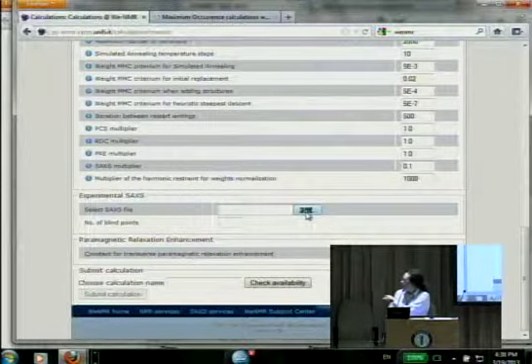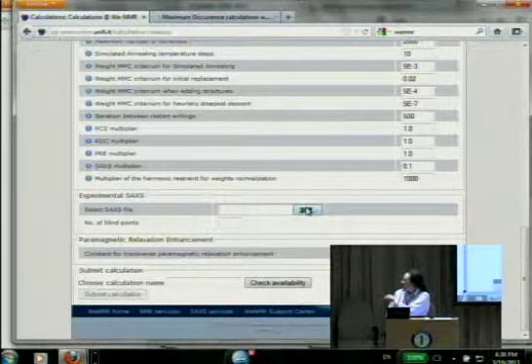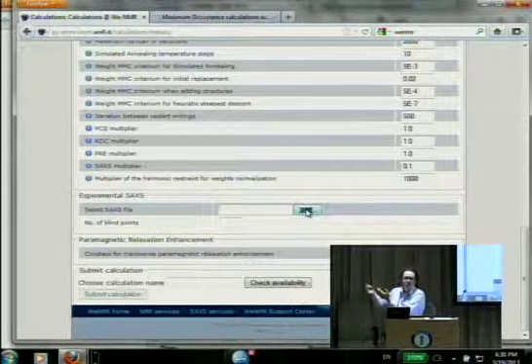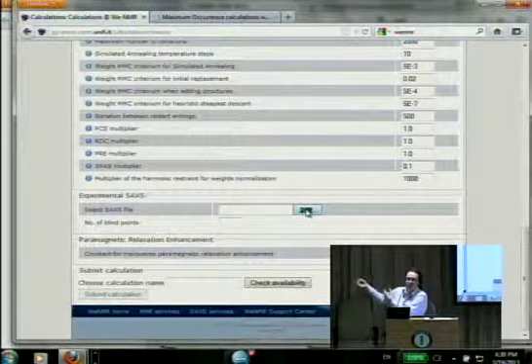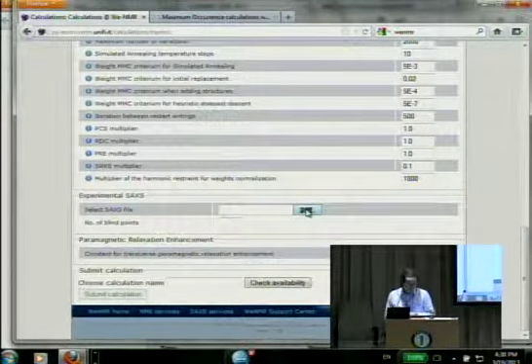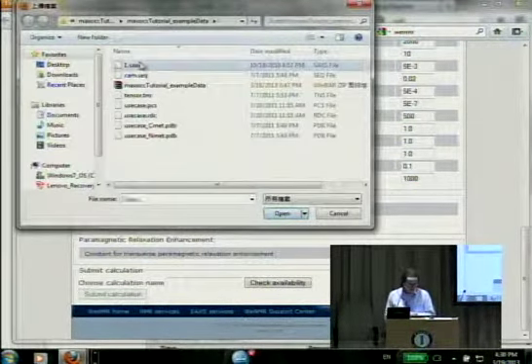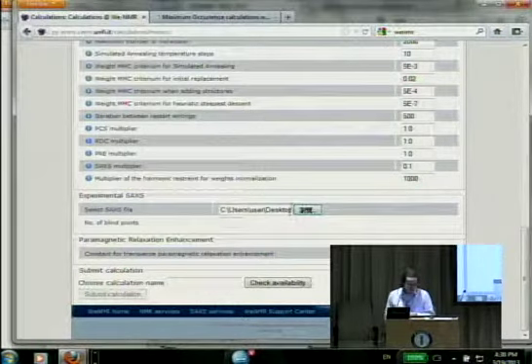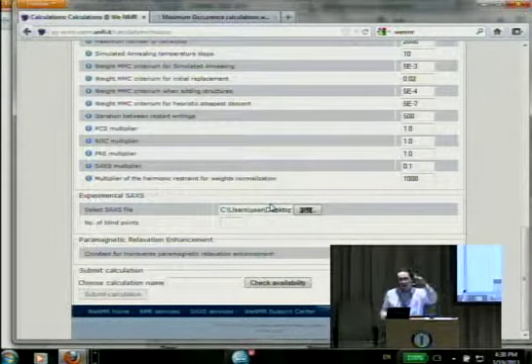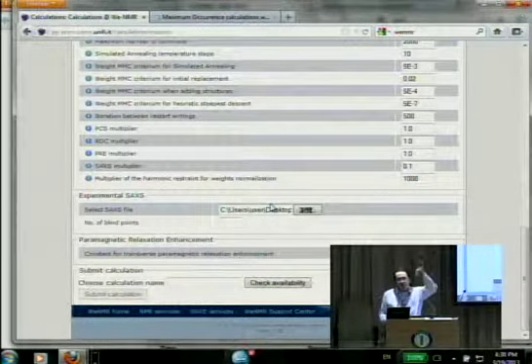So there's also the data profile to upload, and you have to instruct the program how many points you have in the profile that are actually to be discarded because they are in the region where the angles are too small and the program is not able to properly calculate the data. You remember that you had to remove some of the initial points. So here you have to tell how many points you discard.